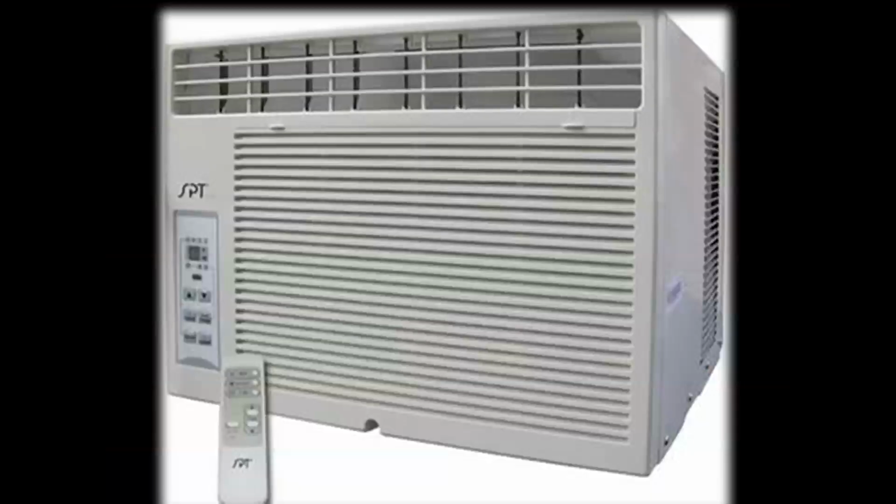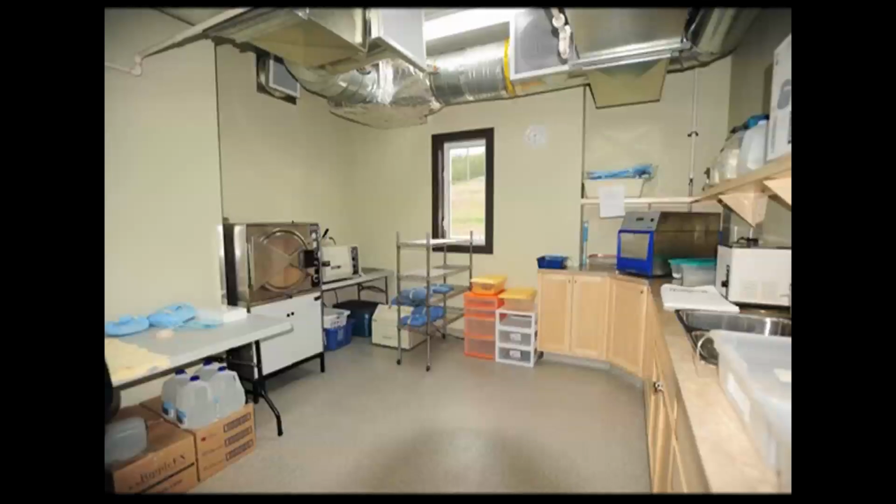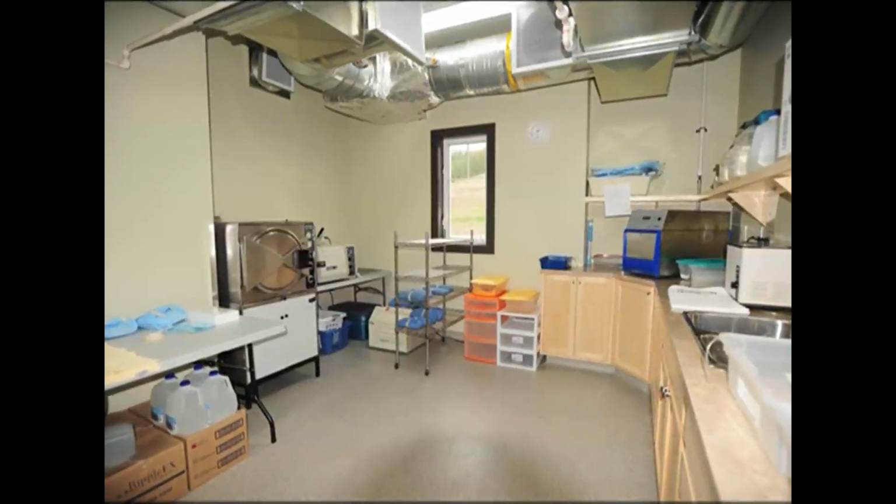So we have seen depth filters, then we come to the membrane filters. In case of depth filters, if you use them in laminar airflow, we get a sterilization of 99.9%, as you said. So if you use these depth filters for the sterilization of a room, in case of ACs fitted with HEPA filters, can we get this amount of sterilization? Exactly. You said rightly that if we use this type of HEPA filters in our ACs, then the air that is coming out of the AC is 99.9% free of particulate matter. But under such circumstances, the room should also be sterilized.